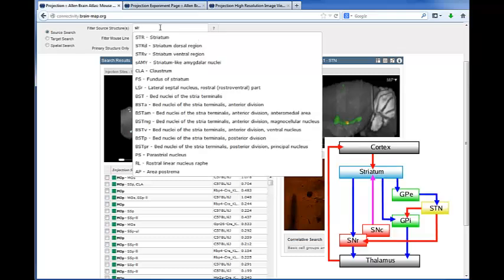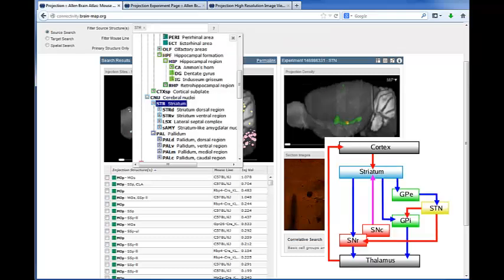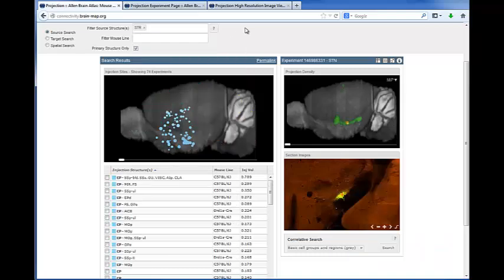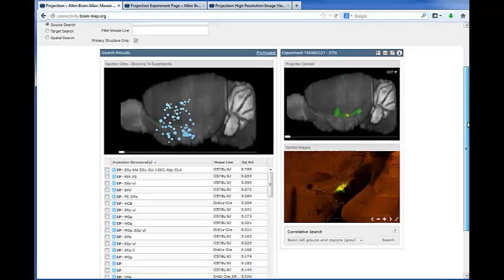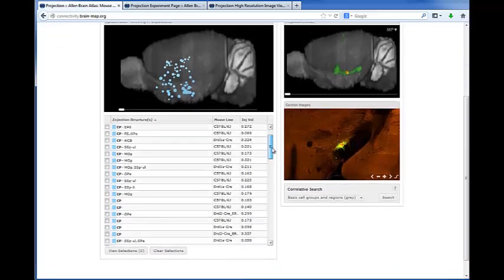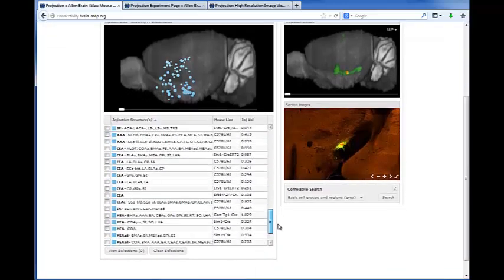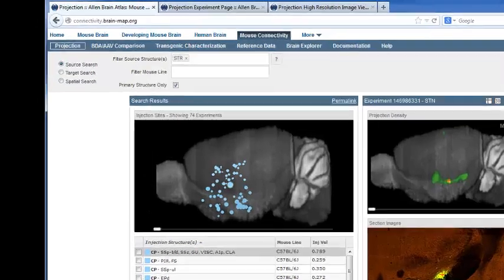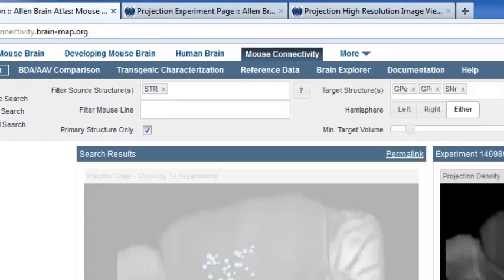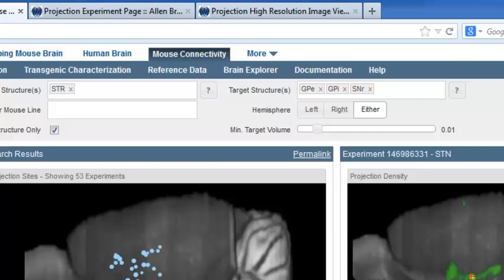If we go back to our connectivity model, we see that the striatum is predicted to project to several structures. When we enter the striatum as the source structure, you'll notice there are over 70 experiments to browse through. To further filter the number of experiments, you can perform a target search and limit the experiments to those that project to specific structures.